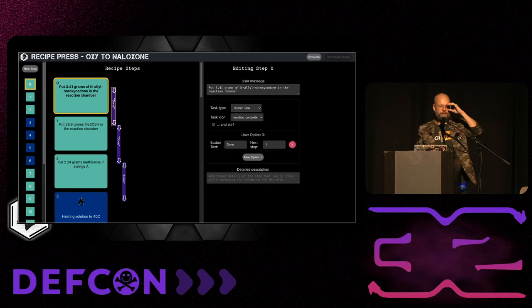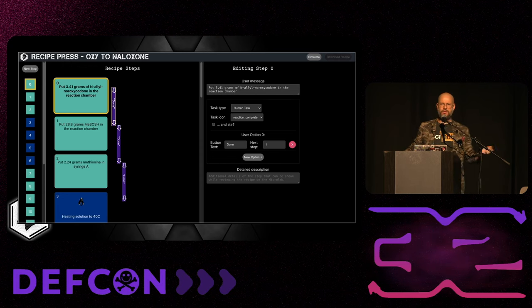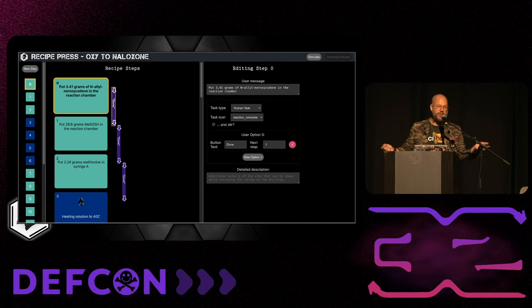You can see there are two different types of steps here. One is the dark blue. That's something that's actually automated. That's something that the computer is doing. Then the turquoise, that is a human step. So, of course, the machine can't load itself full of chemicals. It has to ask you to do that. But there's a touch screen, and it will talk you through that procedure. It says at the beginning, do you have the proper ingredients? Do you have this much? Is it in the solution? Okay, load it into the proper syringe. Are you sure you're there? And then the hard part for a human, which is trying not to watch the water boil while something stirs for 18 hours and making sure that the temperature is just right, the computer takes care of. Again, it's a perfect division of labor the way most things should be.